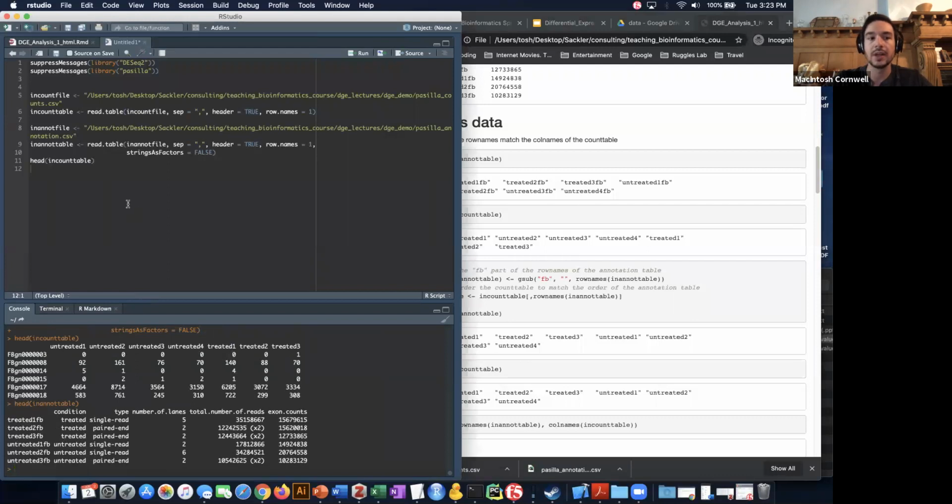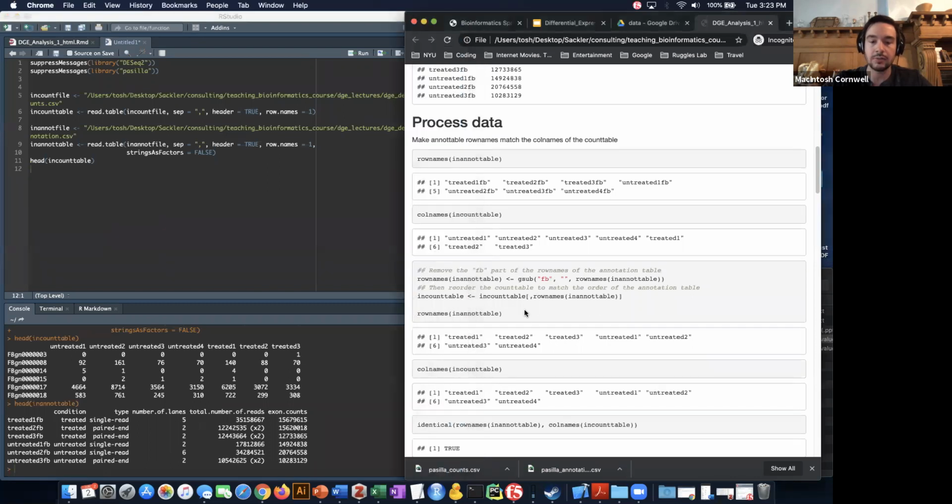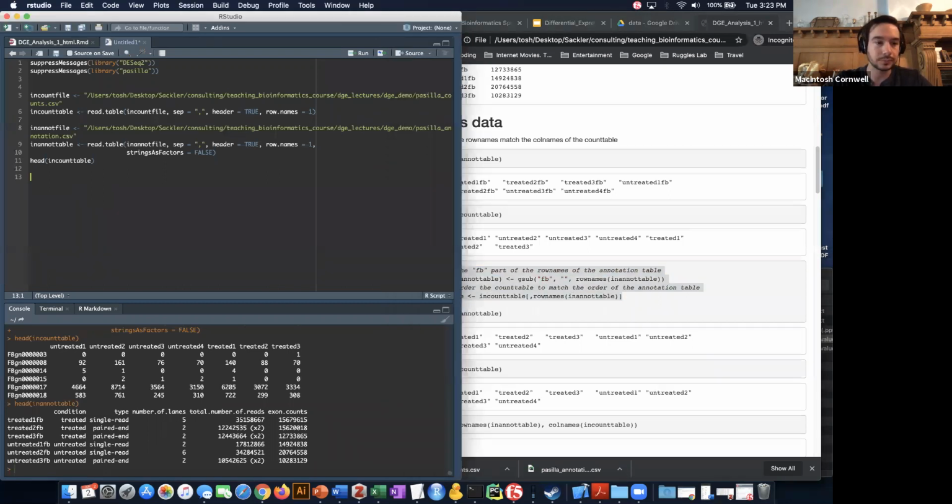Now, it's really, really important that when you're doing this analysis, your data and your metadata have the same sample IDs. Computers can only understand exactly what it is that you put in. And if there's any variation, it will confuse itself. And if it's out of order, it will not necessarily know they're out of order. So we're going to run a couple lines here to make these things the same, and then we're going to reorder them. The first line we're going to run is this.